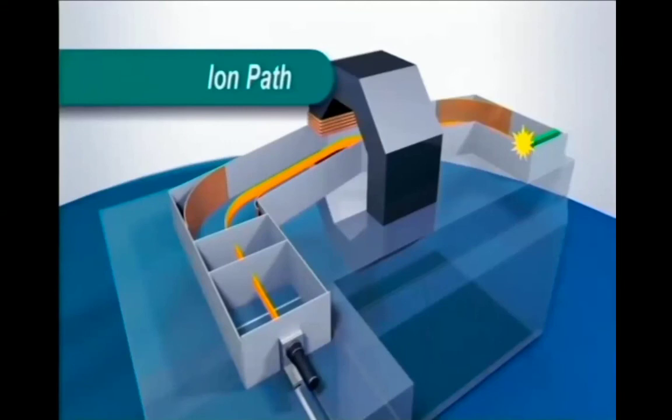The amount of deflection by the magnetic field depends on the mass of the ion, strictly its mass to charge ratio, but the vast majority of ions have only a single charge. The deflection also depends on the strength of the field. Heavier ions will not be deflected sufficiently in the magnetic field to reach the detector. Lighter ions will be deflected too much. During a run, the magnetic field is gradually increased so that ions of successively greater mass enter the detector.